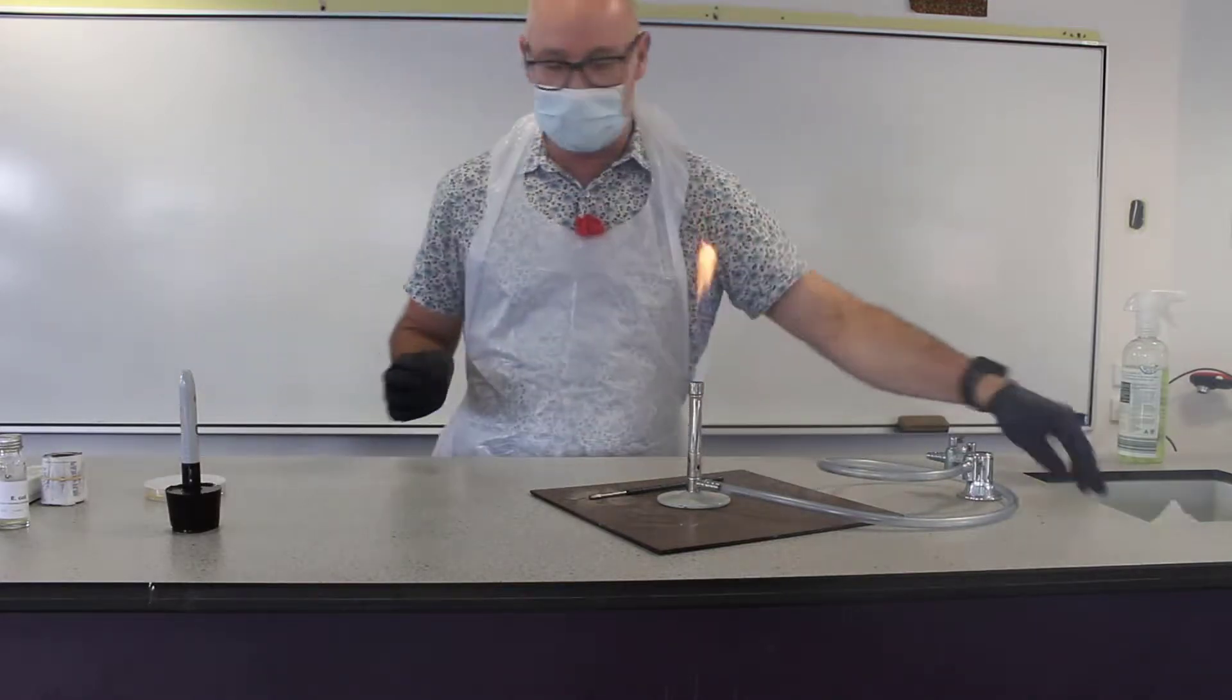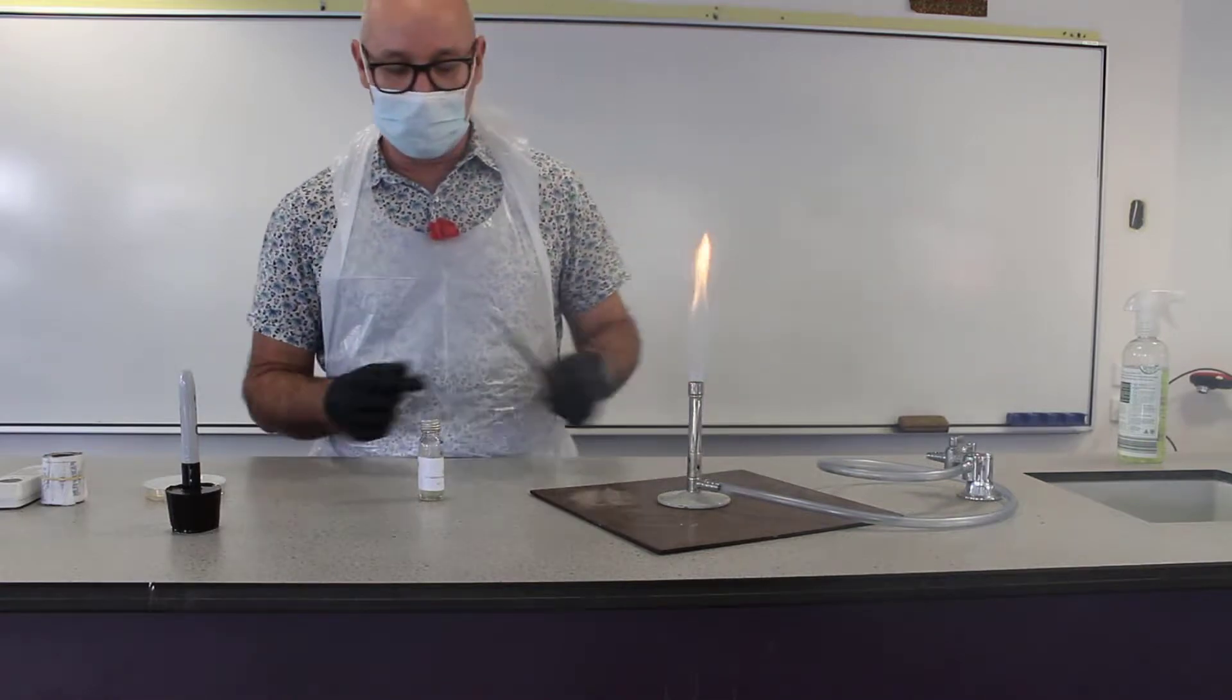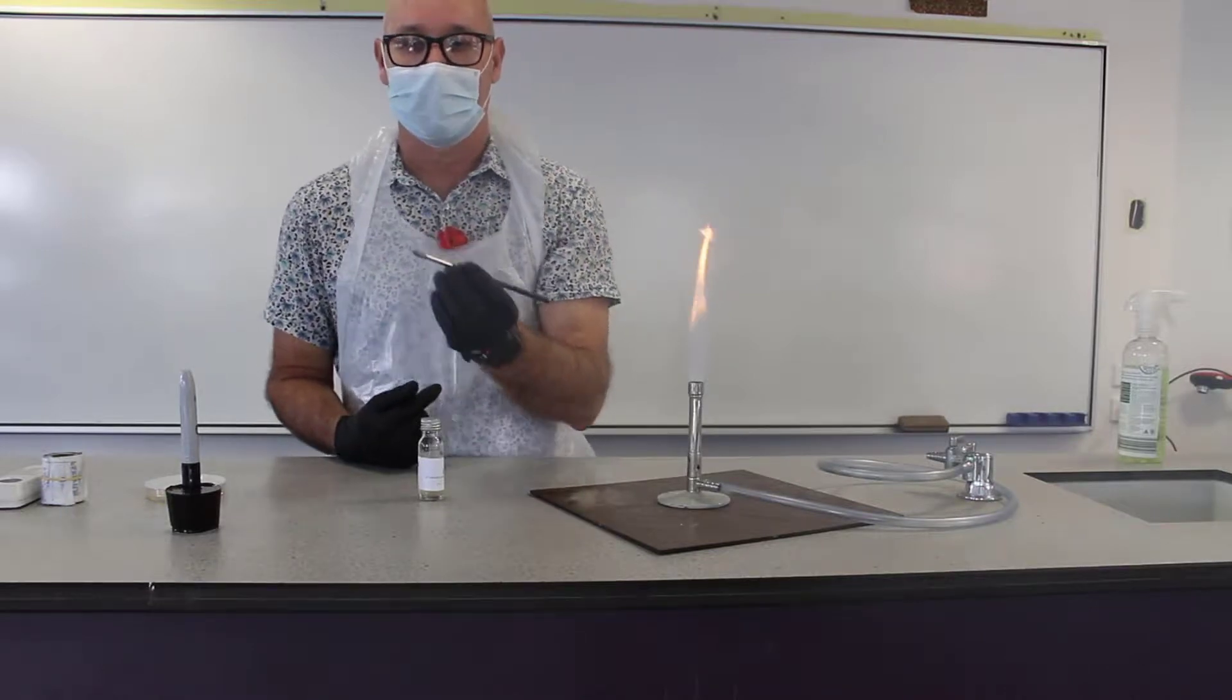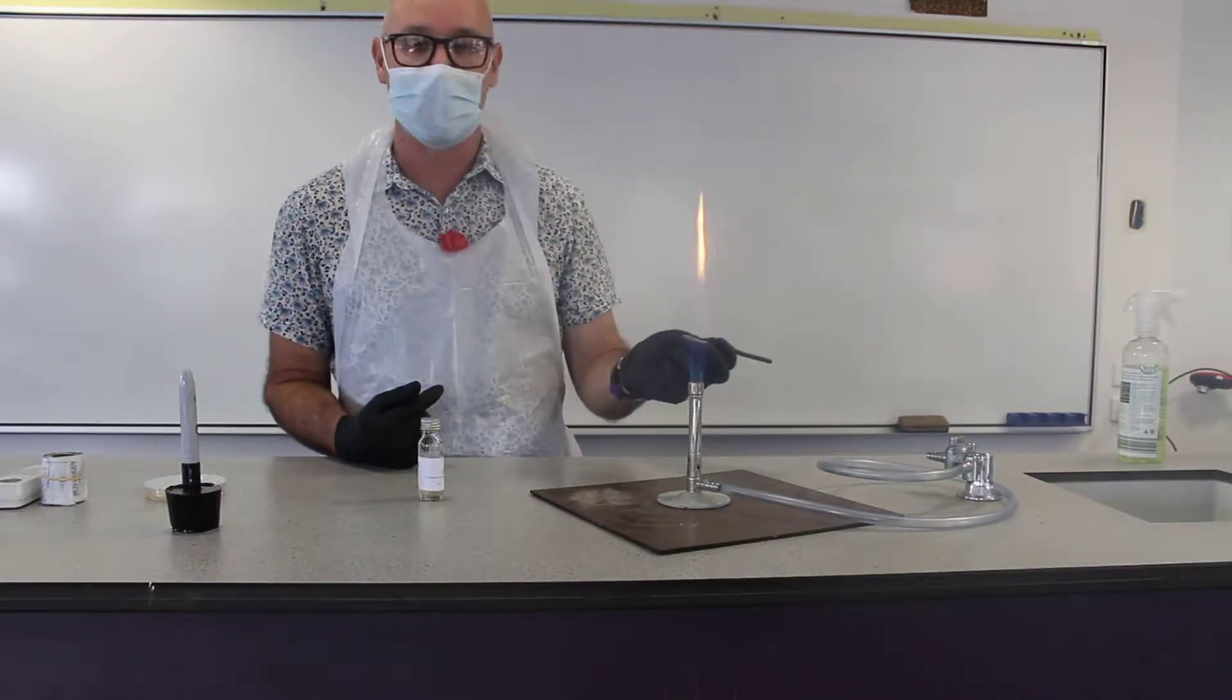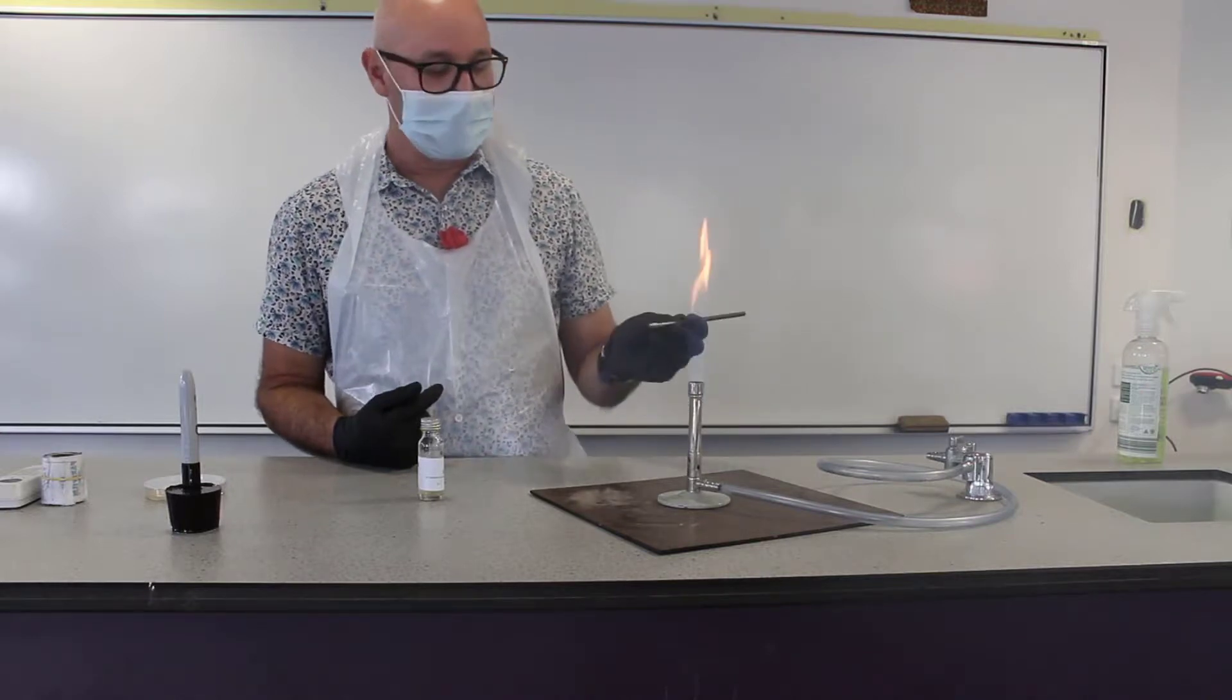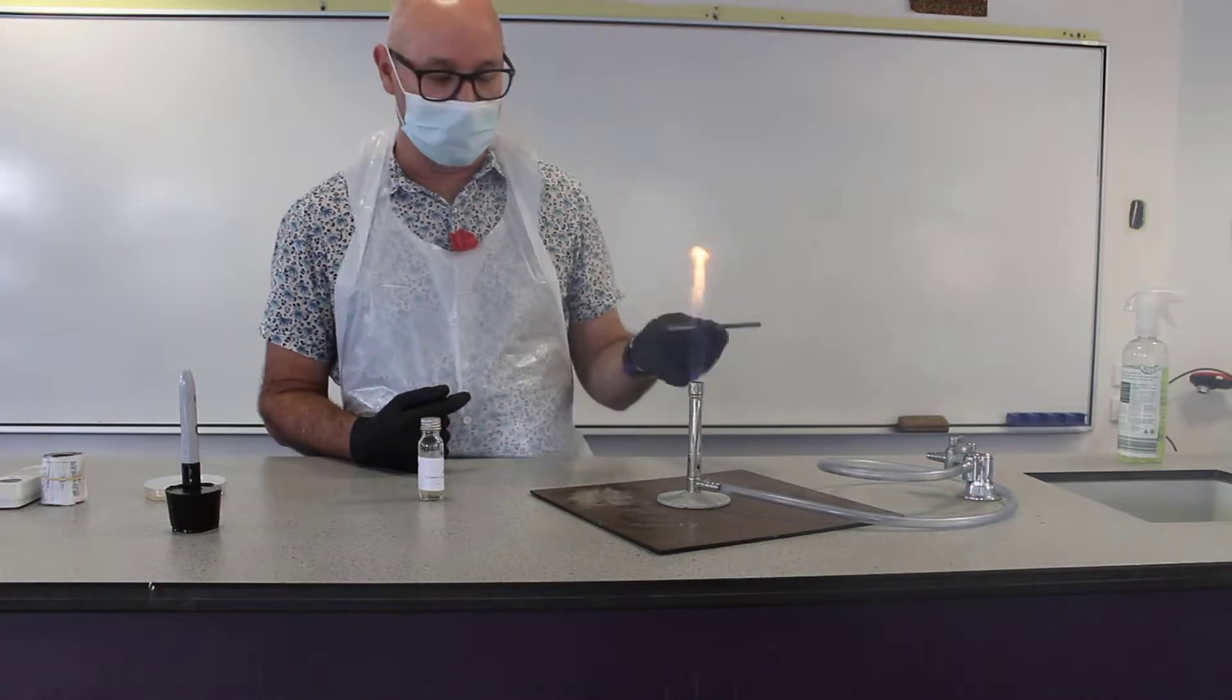Now, so now we're about ready for our technique. We're going to inoculate our plate with a metal loop. The metal loop we can flame in the Bunsen burner flame. This is going to kill any bacteria that are on the loop.